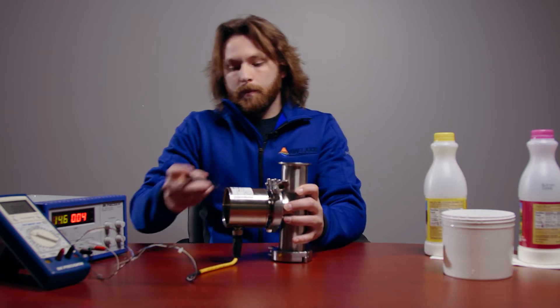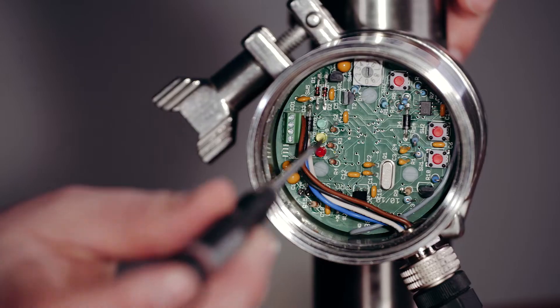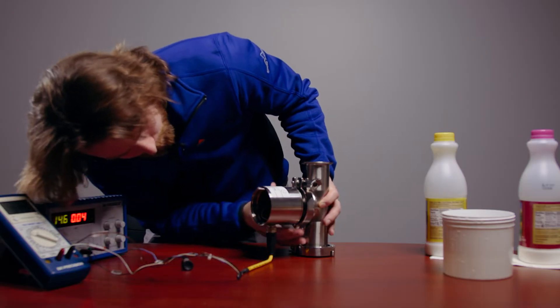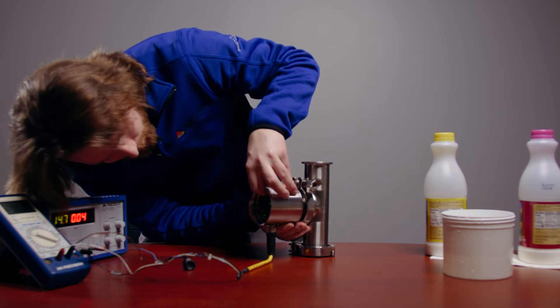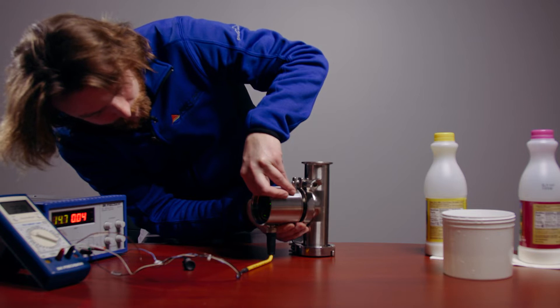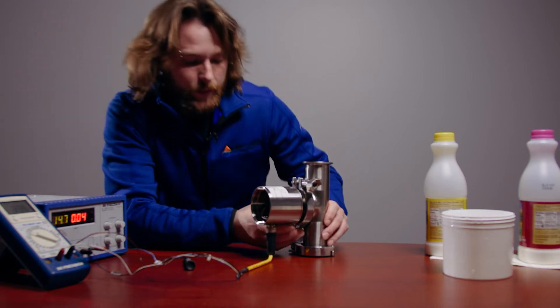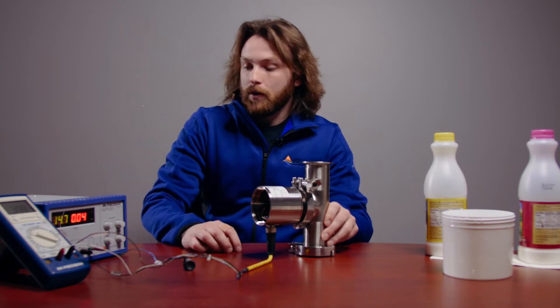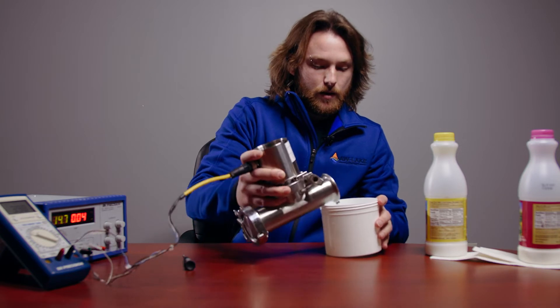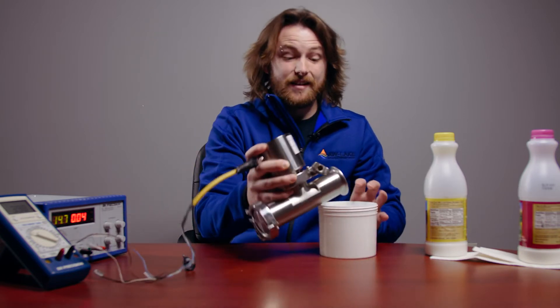We'll start by turning the rotary switch to position zero. Once there, press and hold the button and you'll see the yellow LED flash twice. That means your point was taken. Once that's done, you can empty your sample and proceed to the next.